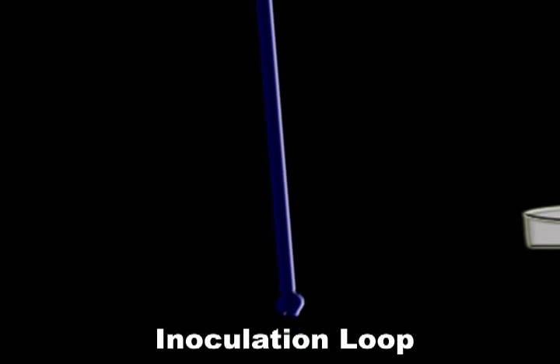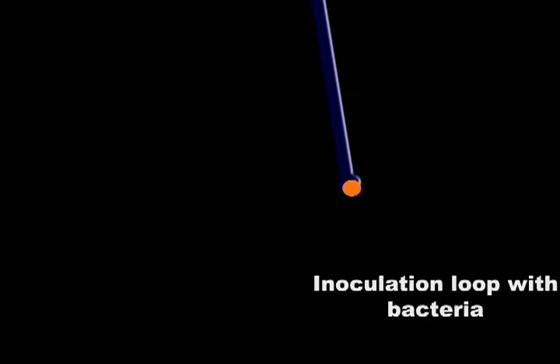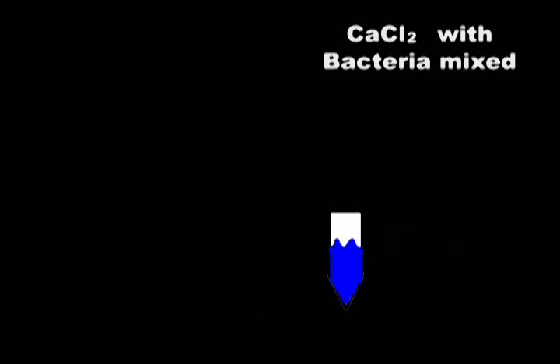Our first step will start by using an inoculation loop to collect some colonies of bacteria from the streaked plate. After that, transfer the bacteria into one of the tubes containing the calcium chloride solution. Twist the loop in the solution until the bacteria is in the solution.